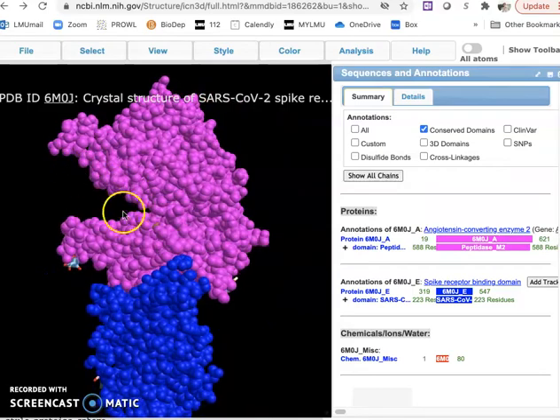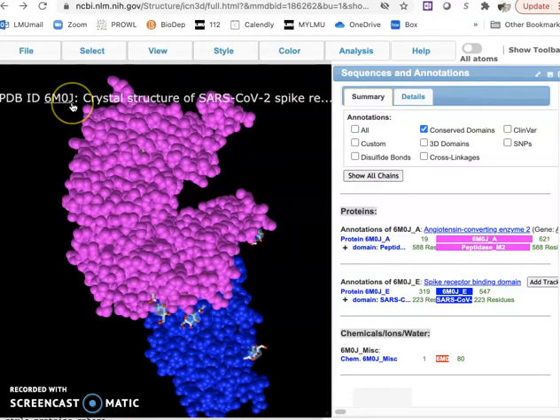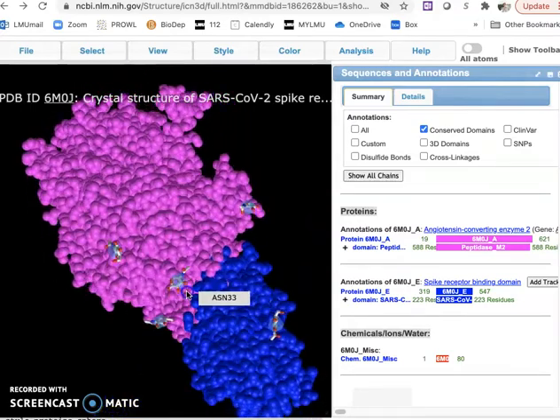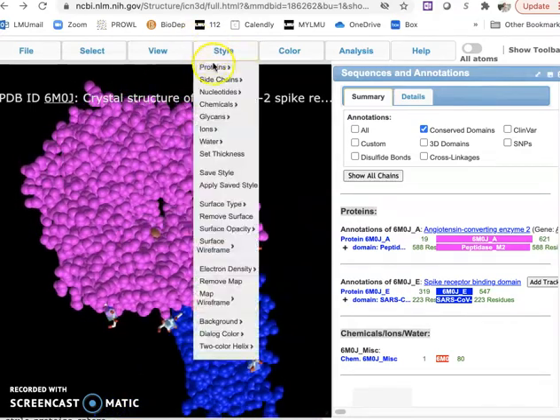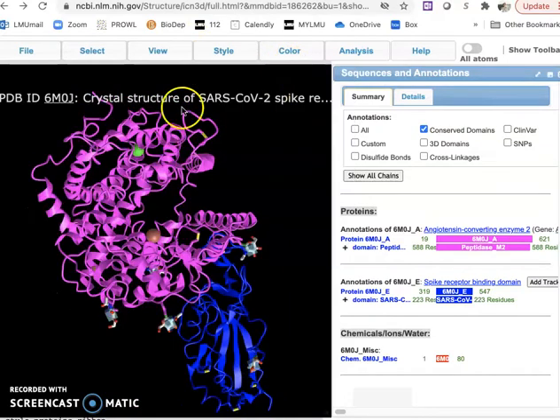Spheres help to visualize interesting cavities and just the overall shape of the protein. It's kind of nice. To go further in the assignment, it suggests using this sphere option to visualize other styles, but I will switch to the ribbon structure for that.